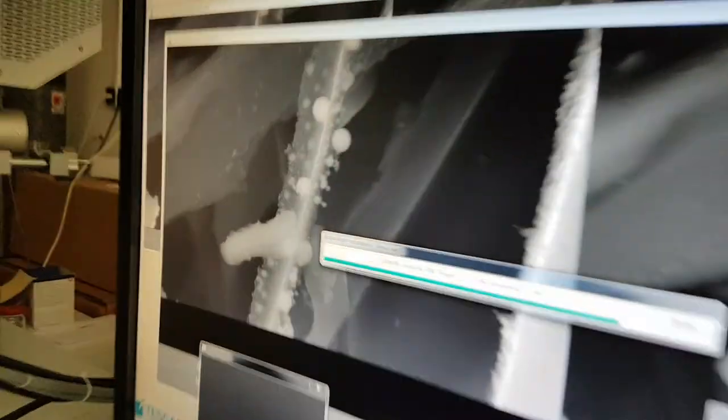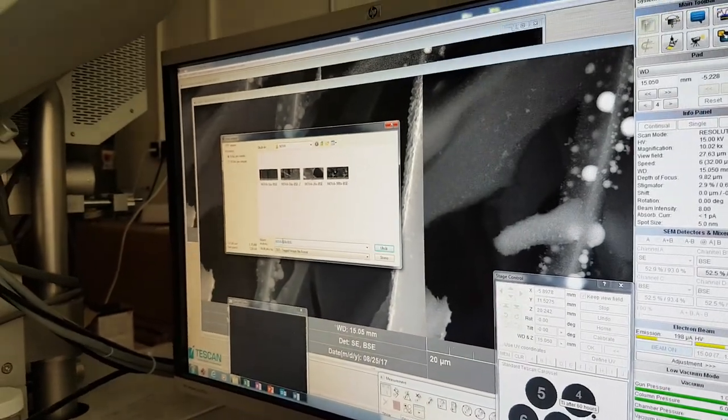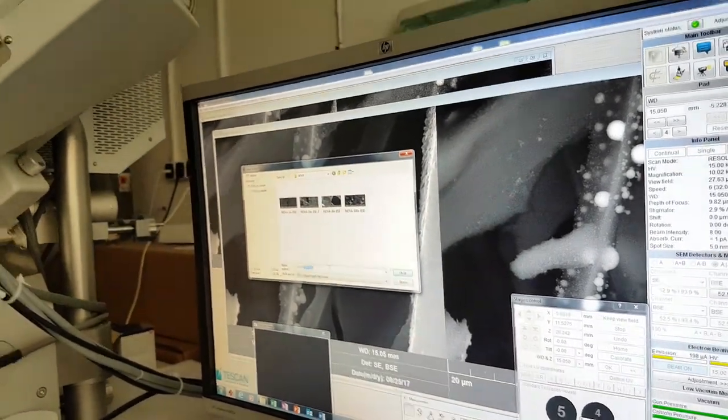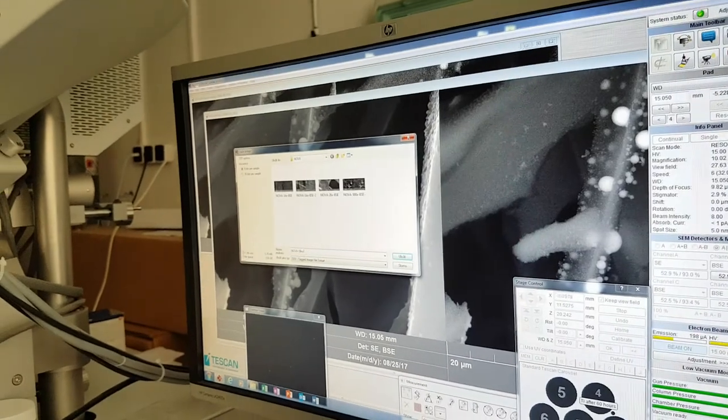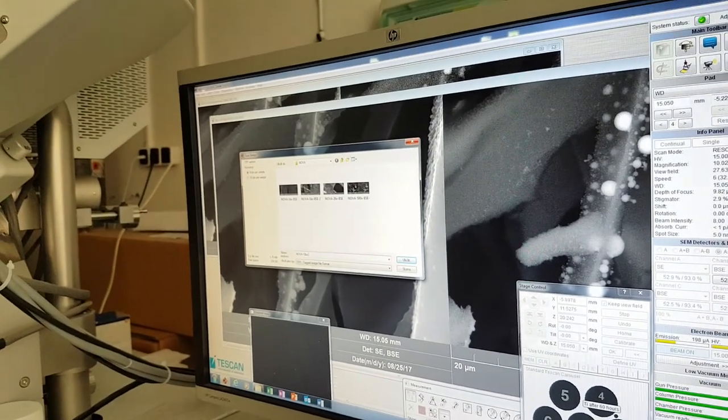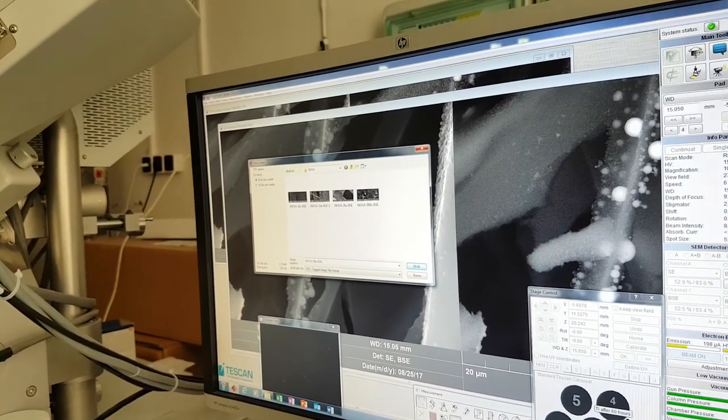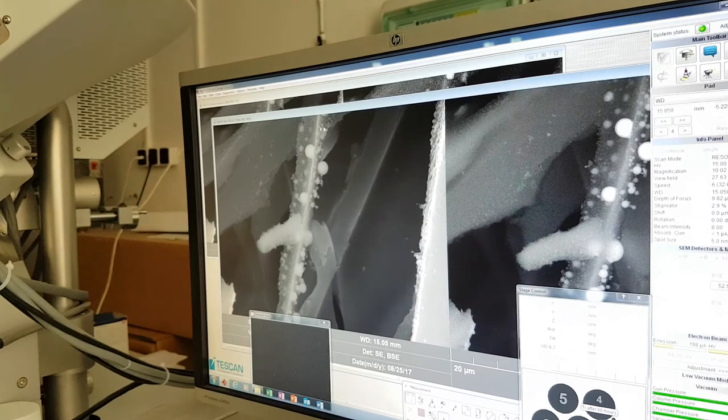And, in fact, when you look over here, there's incredibly small nanospheres on there. So, this little fiber of charcoal was able to, would seemingly have been able to loft itself up into.